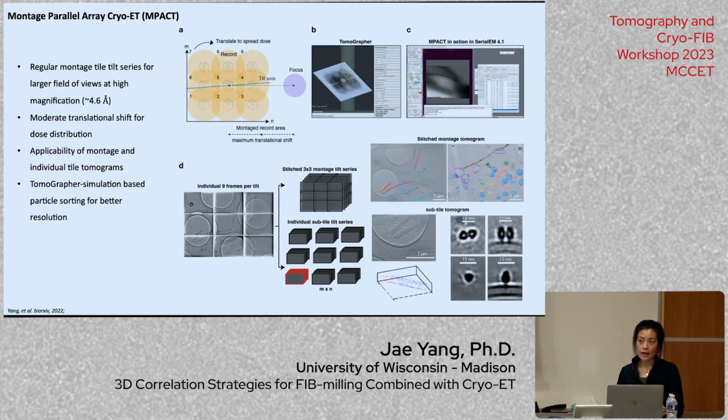I think it is a question more for the lift out. I don't know. I would say for the complex, from the standpoint of the correlation, it really depends on how small or how big your target is. And that can help you to identify which way is better. And then also the thickness of your lamella.